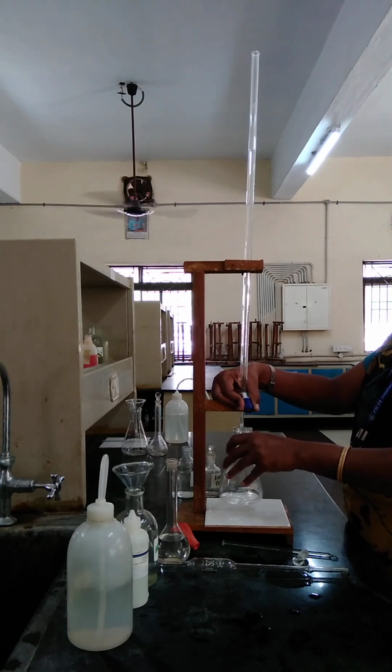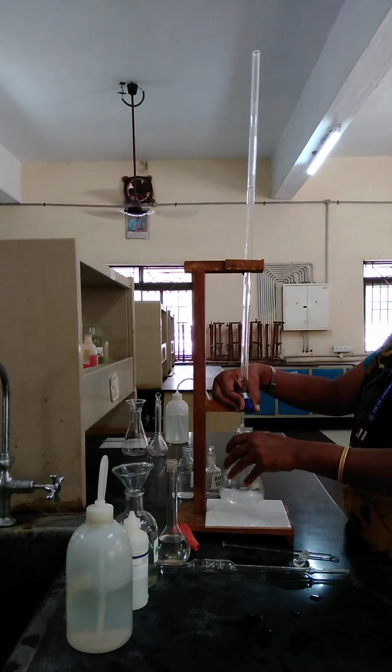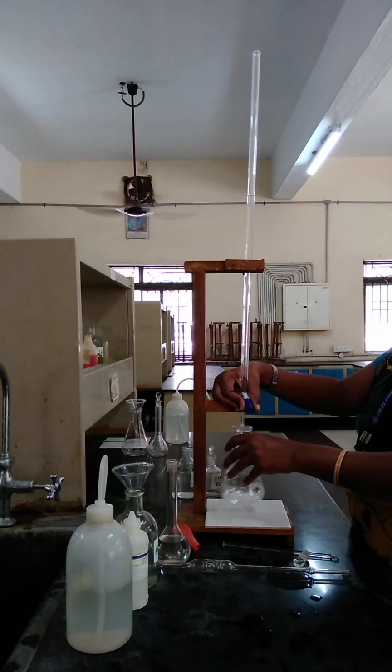Whatever we did last time with the oxalic acid standard solution and pure sodium hydroxide solution, we get the same endpoint. Here also it is acid base. The first one, the weak acid, consumed 25.5 ml of sodium hydroxide.